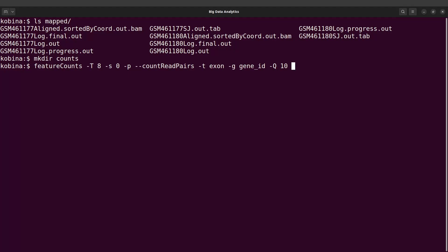We are also going to specify the annotation file. Here we are referring to the GTF file. We can find it at data/ref/DM6.gtf. To specify it, we say -a data/ref and specify the GTF file.